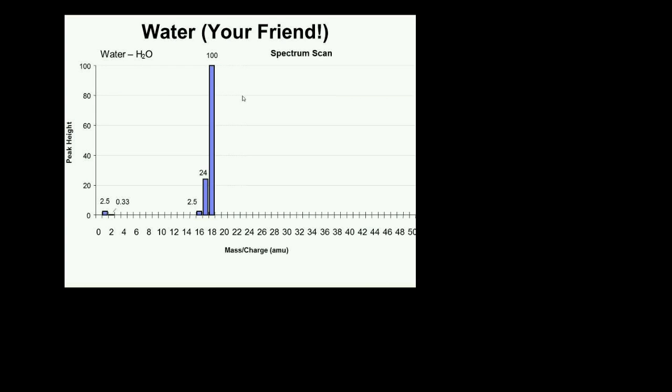Now here's the deal. Every time you turn on the RGA, the filament will get hot. It will start outgassing water all by itself, but it will also start radiating infrared radiation onto all the adjacent surfaces, which will get hot. If you touch the area around the ionizer, it will feel warm. Well, outgassing is directly related to temperature. So as soon as the filament turns on and the surfaces start heating up, stuff that had a low Q value for outgassing at room temperature is now outgassing at a faster rate.